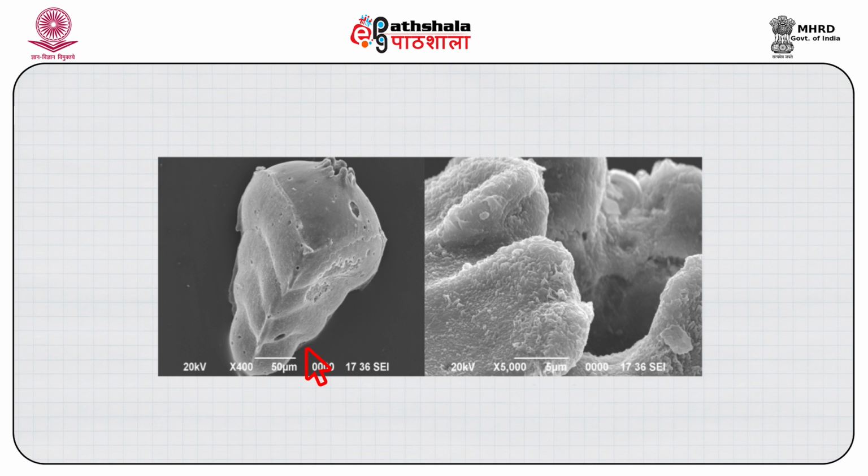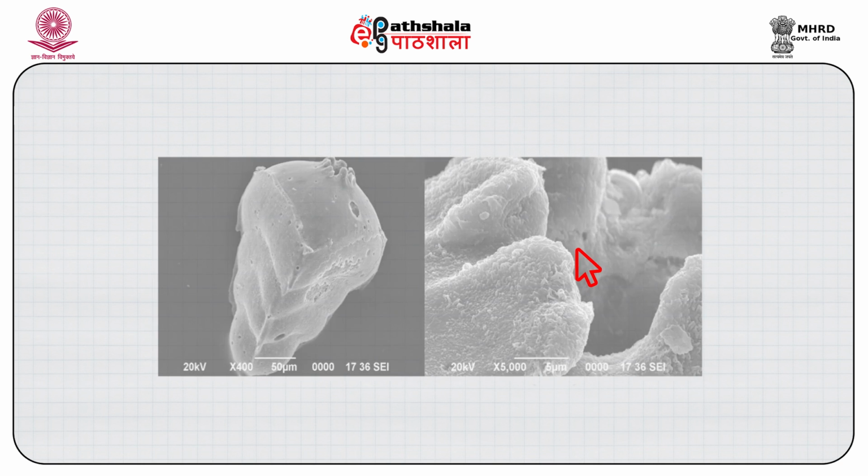In the first figure we see a relatively larger image which is magnified in the second diagram, where the marine microfossil is illustrated very nicely, and one sees the distinguishing features of the fossil nicely outlined as a result of the secondary electron image. You can see that this is at 5000 magnification, and one can achieve significantly higher magnification for resolving these images, which is not possible with an optical microscope.